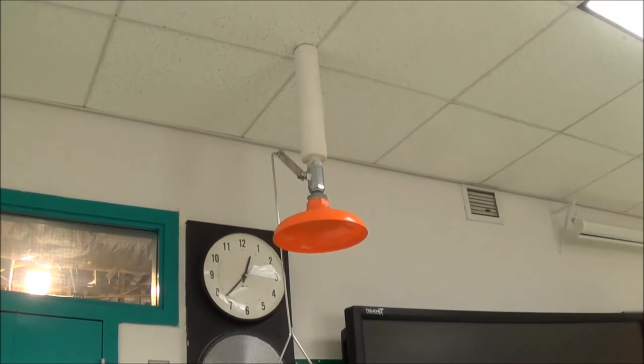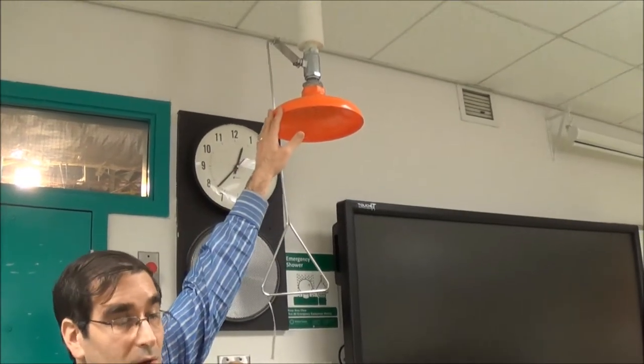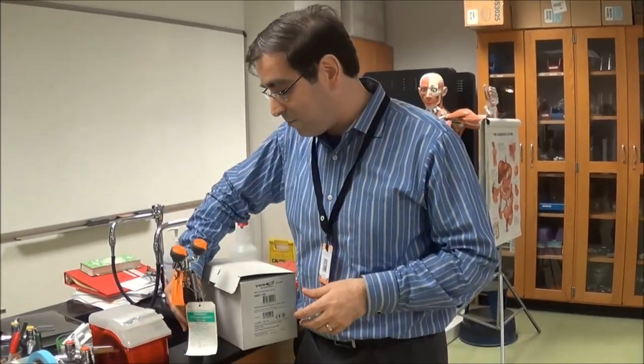In the labs you work in, the safety shower may have rope pulls instead of metal pulls, or different colors for the cone on the end, but in general it will always work the same. The eyewash stations also vary — many can actually be pulled off and have a hand trigger to use. However, some eyewash stations are mounted to the desk and have a lever that you push to use them. Either way, they're both eyewash stations and they both function the same way.